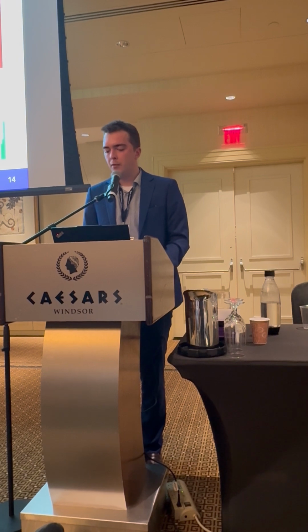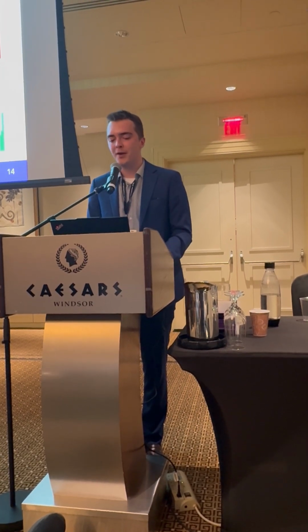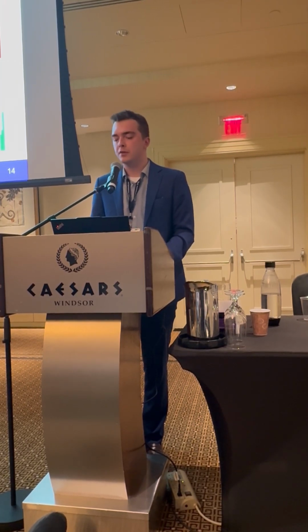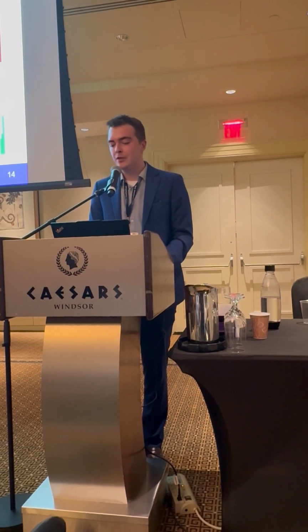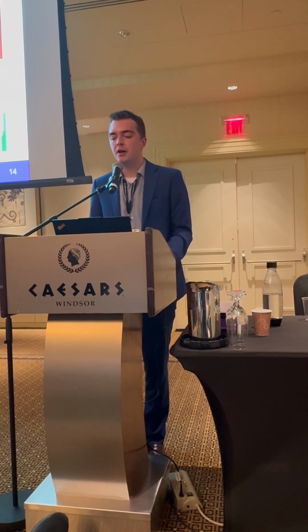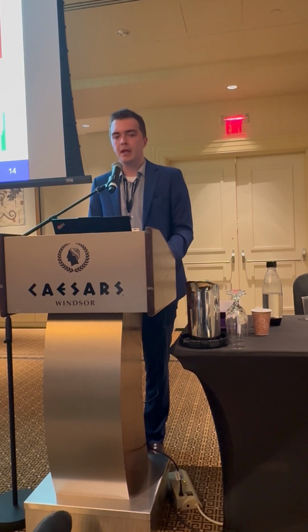Next, on the right here, I did that variant allele frequency distribution comparison, putting them on the same logarithmic scale to allow for direct visual comparison, where you can see an obvious rightward skew of the knockout cohort, demonstrated in the red histogram here, where the mean VAF across all 4 samples of those shared mutations was 0.938 and a median of 0.996, indicating that the vast majority of these variants shared across all those knockout mice are occurring in a nearly complete homogeneous fashion across those individual samples, which is really consistent with the inter-mouse clonal homogeneity that we predicted based on the previous data.